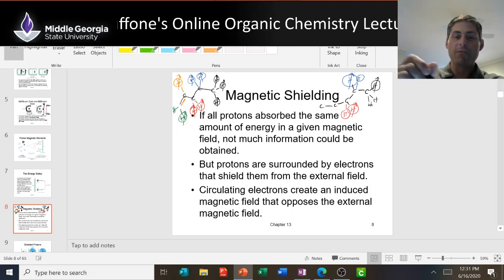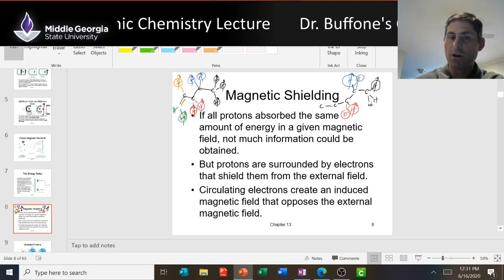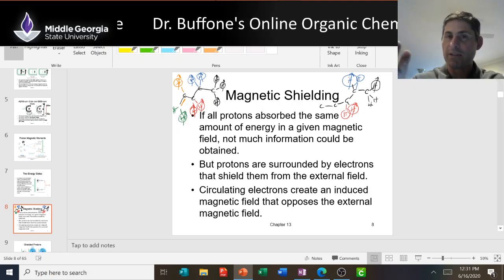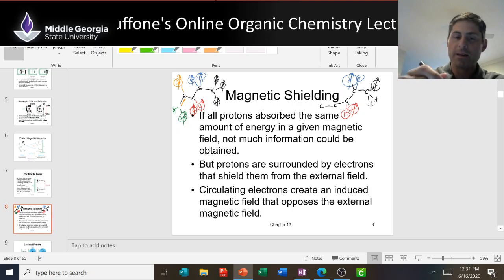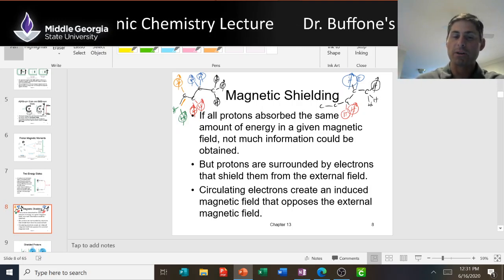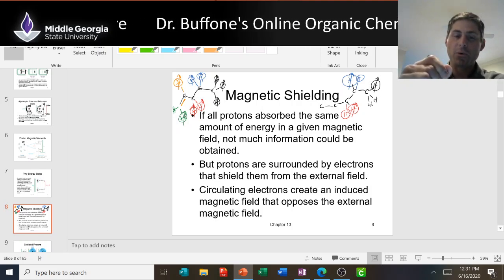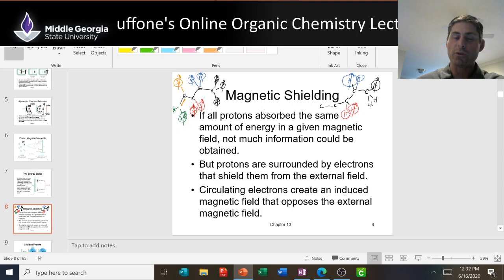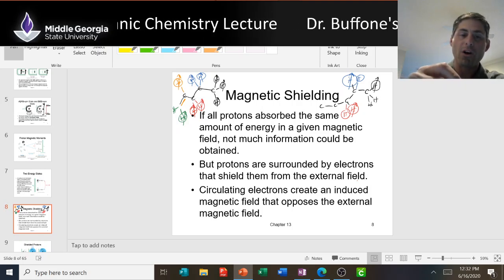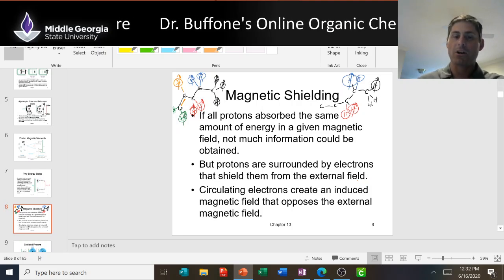So now I have protons in black on carbons that are alkyl carbons, right? I have a methyl group, an alkyl group. I have a methylene group, which is kind of like an alkane-type fragment. I have another methylene, which has 2 protons that I've labeled in red, an alkane-like fragment. And then I have a proton in orange and 2 protons in green that are on carbons that are a part of a carbon-carbon double bond. So these are alkene-like carbons.